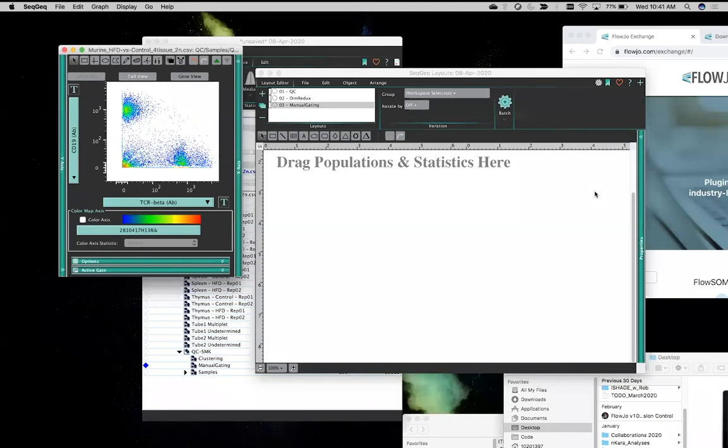Where it makes a bigger difference is things like UMAP. UMAP seems a little bit more sensitive to the distance function that you utilize there. So good question. Only done a bit of benchmarking myself. So if you find that you are seeing better results with one of those other distance functions, you know, please reach out. We'd be interested to see what you come up with.